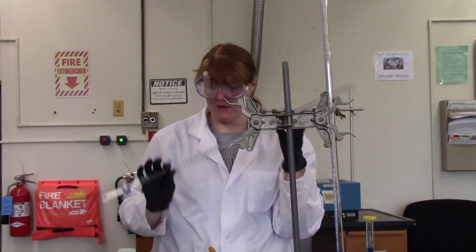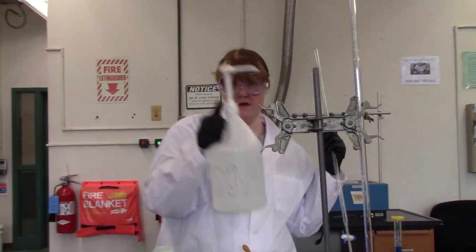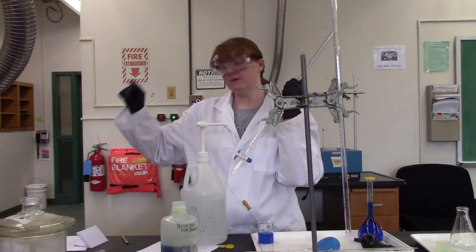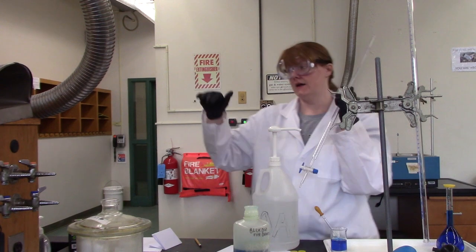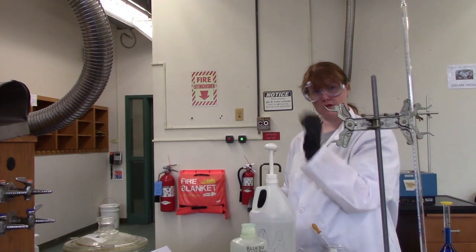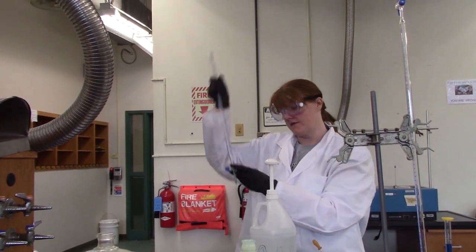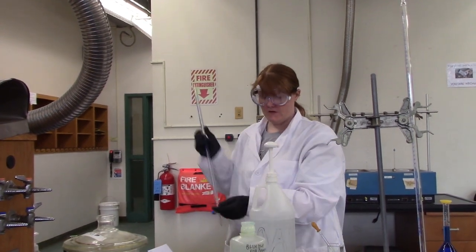Okay, so in the procedure, it tells you first to wash with a mild soap solution. That's this thing, okay? And so when you're cleaning a buret, you're going to do it in the sink. Our sinks are especially deep with really high faucets so that you can do this, all right? So you're just going to hold it in the sink, and you can pump a few squirts of soap in there. Close this part, this valve, and you can shake it to get it clean, okay? That's step one.